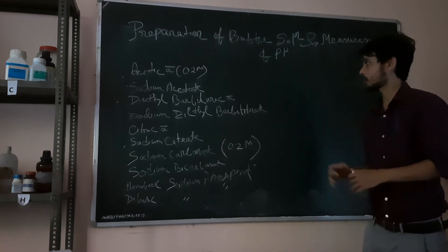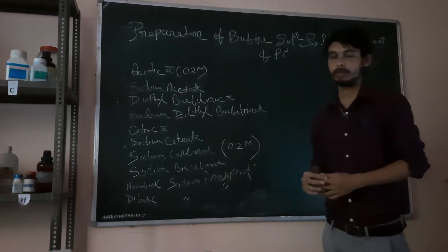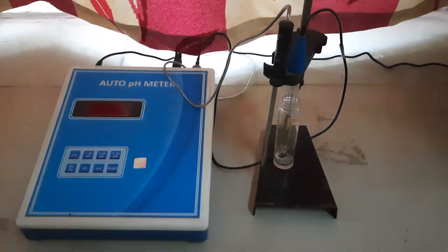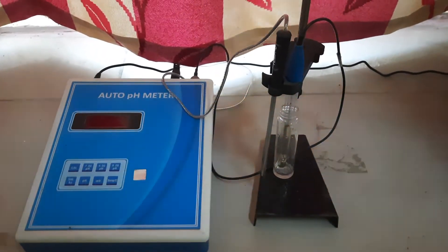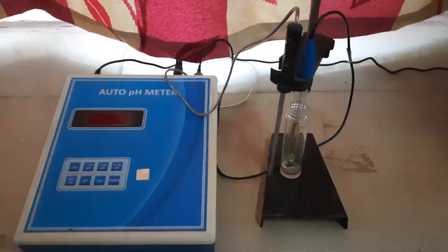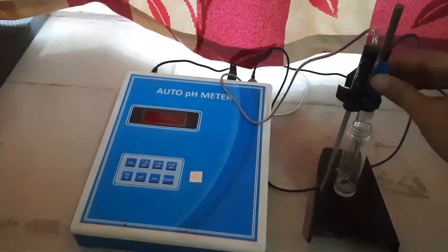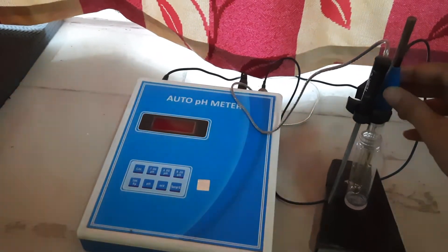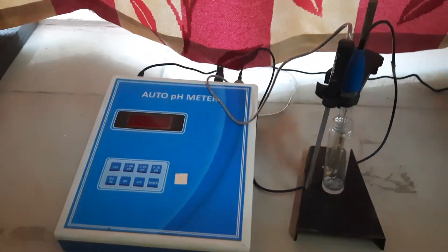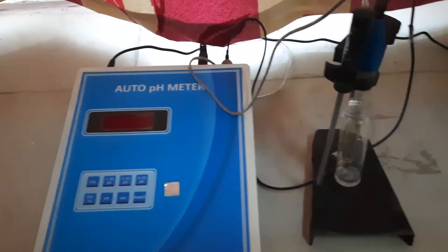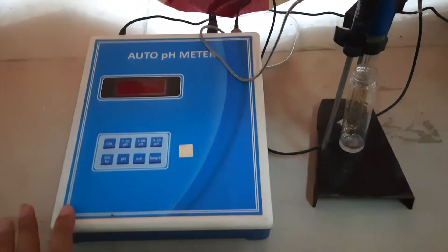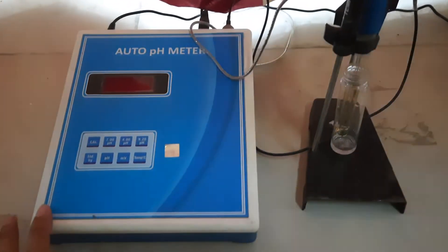Here you can see the pH meter we have. This is an auto pH meter and this is the glass electrode. The glass electrode is connected to this voltmeter via wire. We also have a thermometer so we can determine the temperature of the solution.